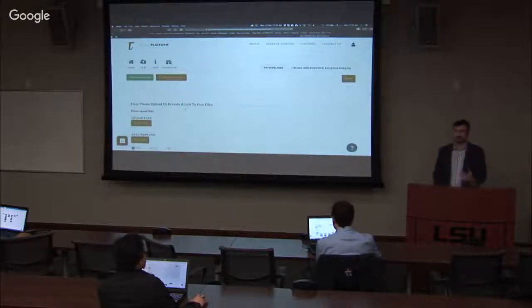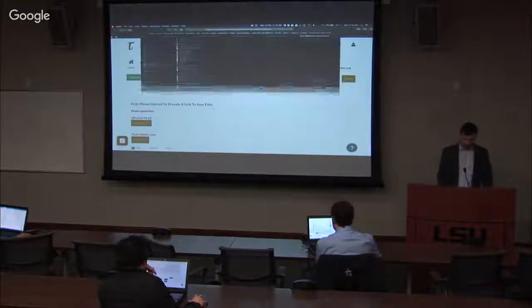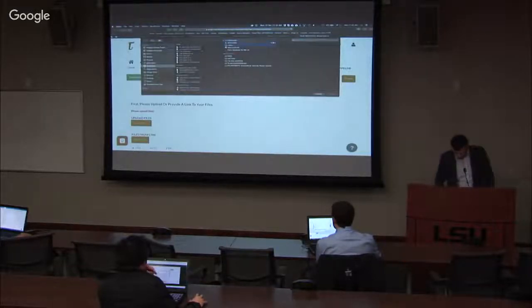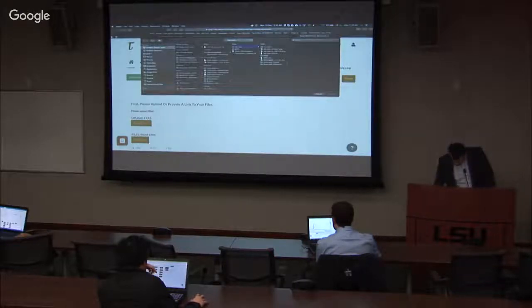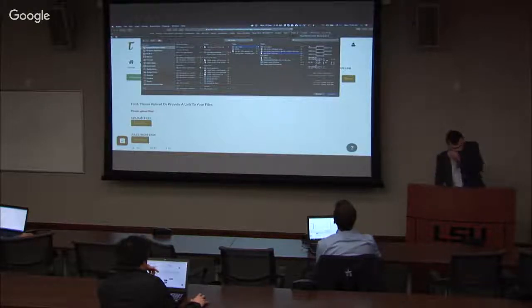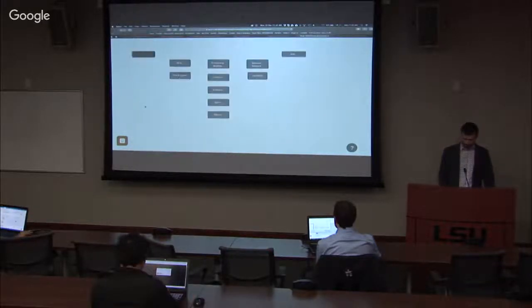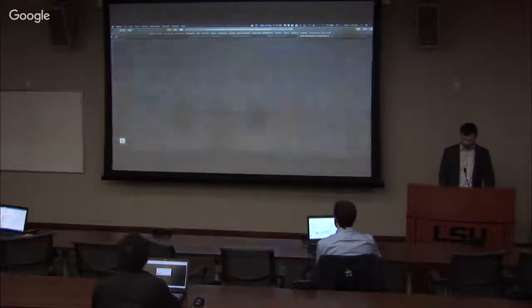The other data set that we have is the cell lines. And there, it's a lot more classes, right? Here we really have two or maybe three, but there we have a bunch. So here we can go back to the folder that I gave you, the cell lines. We can take this one. Well, hold on a second. Okay, actually before we do, later on we'll have to update the naming of those. But let's take a look at what happens.